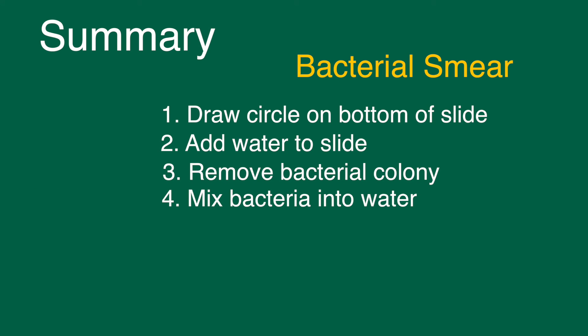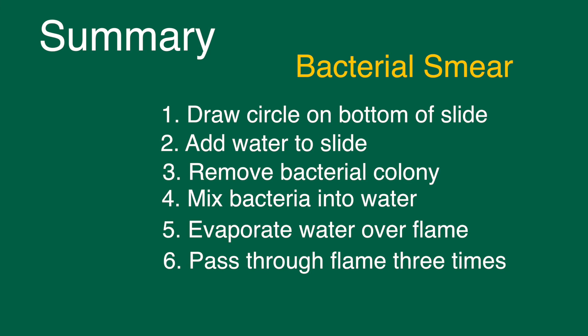Mix the bacteria into the circle of water, and following that we hold the slide above the flame. After the smear is dry we take a clothespin, attach it to the end of the slide, and send our slide through the hottest part of the flame three times.